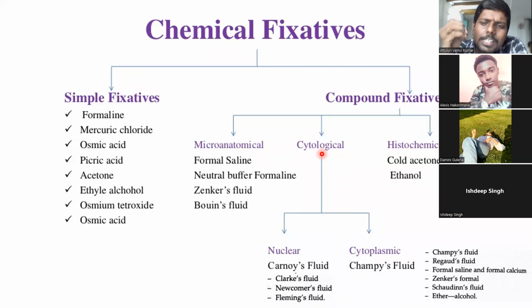There are many genetic diseases that occur due to chromosomal variations. Such chromosomal studies can be done by suspending the cells in a cytological fixative.